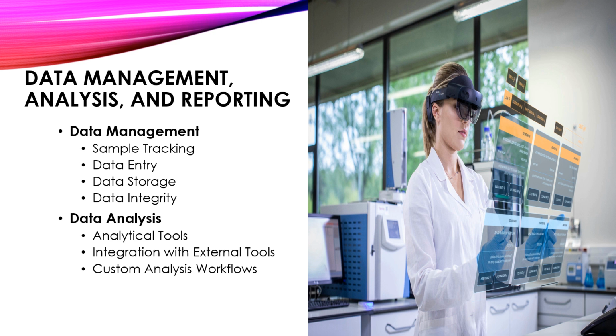And integration with external tools. Laboratory management systems can integrate with external software tools, external analysis software or programming languages like R or Python for advanced data analysis and visualization. So LMS can be integrated with other tools such as Python or R. That is, other software or advanced data analysis and visualization tools.